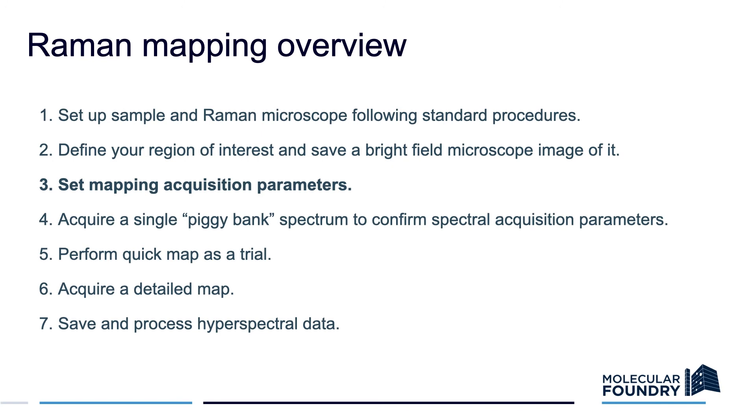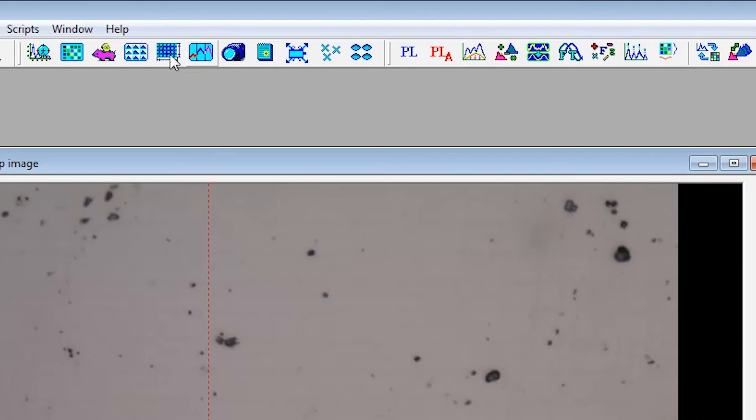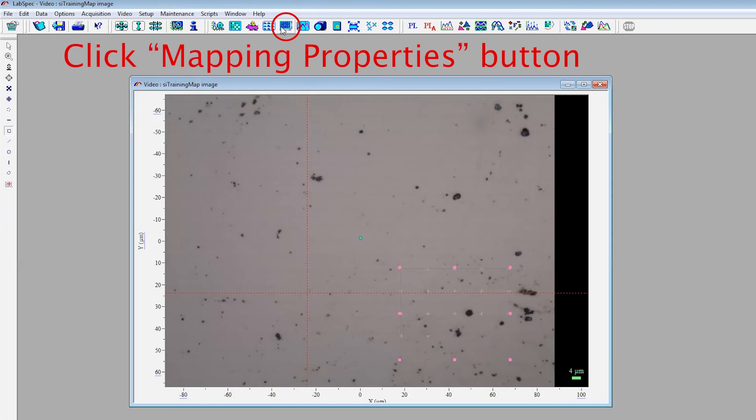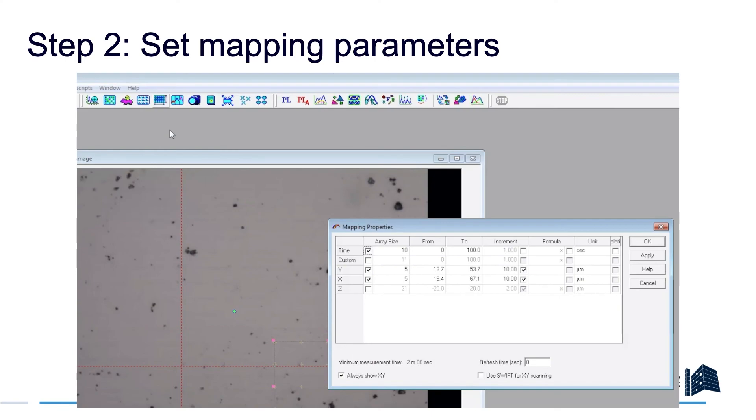Once you've set your region of interest, you can set your mapping acquisition parameters. You do this by checking this grid-like icon that says Mapping Properties. This will open up the Mapping Properties dialog box. Here you can see all of the different parameters that control how dense your map will be.